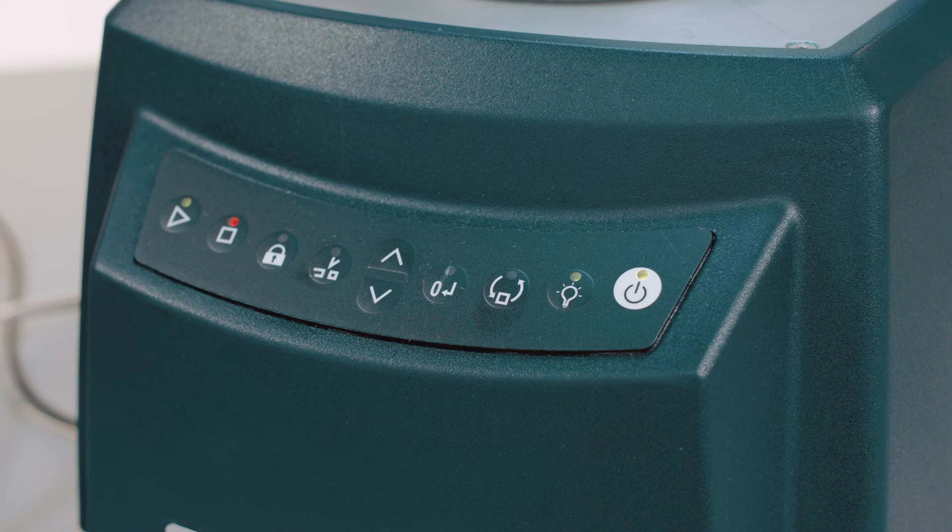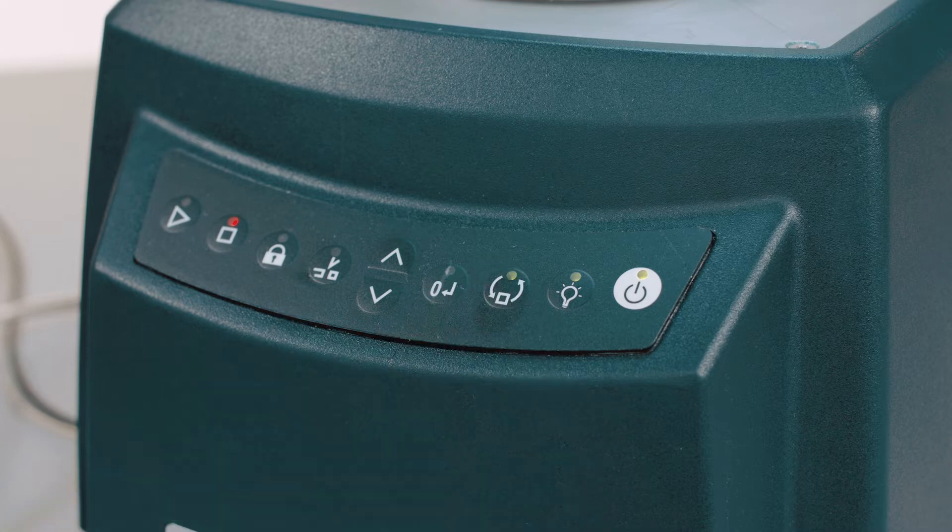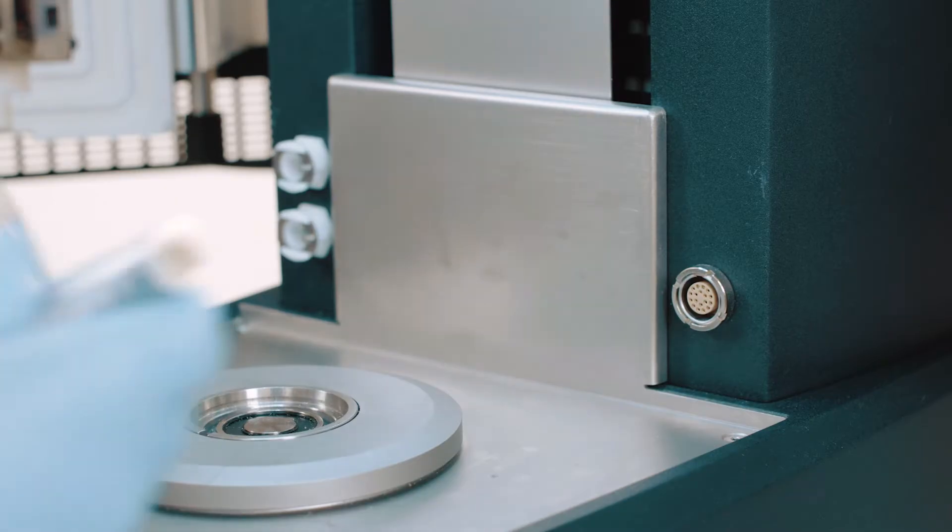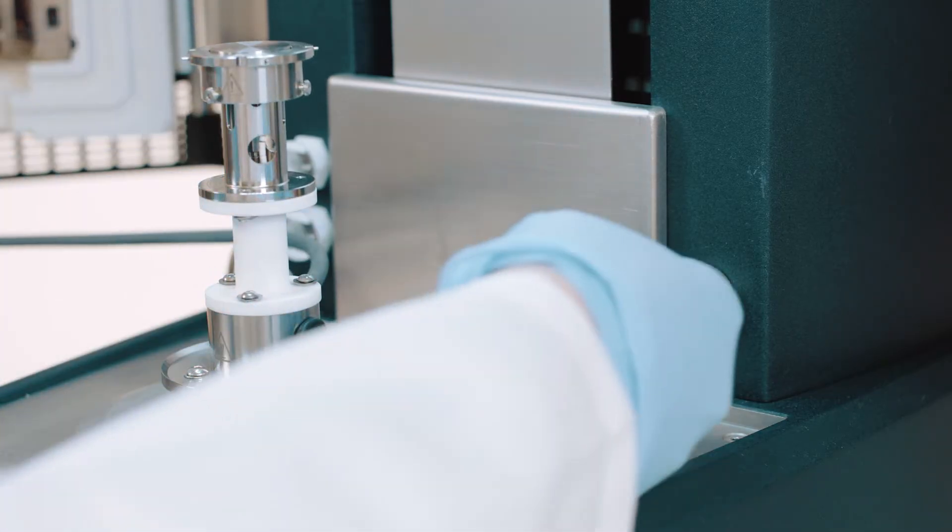To install the Auto Trim Accessory onto the Discovery Hybrid Rheometer, press the release button and load the pedestal, then plug in the accessory cable.